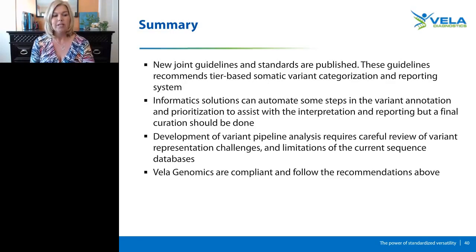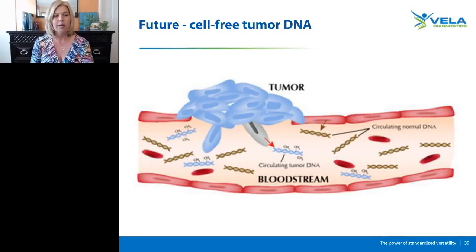So let's begin with our first question. This question is for you, Dr. Mamoud. How important is it to analyze the integrase gene for HIV DRMs?